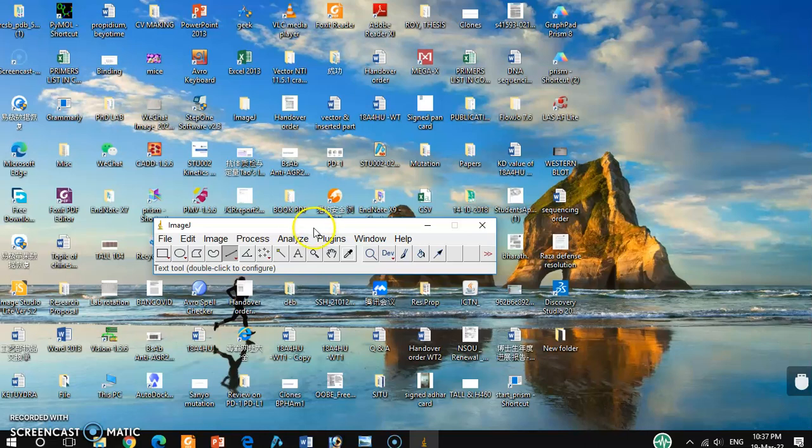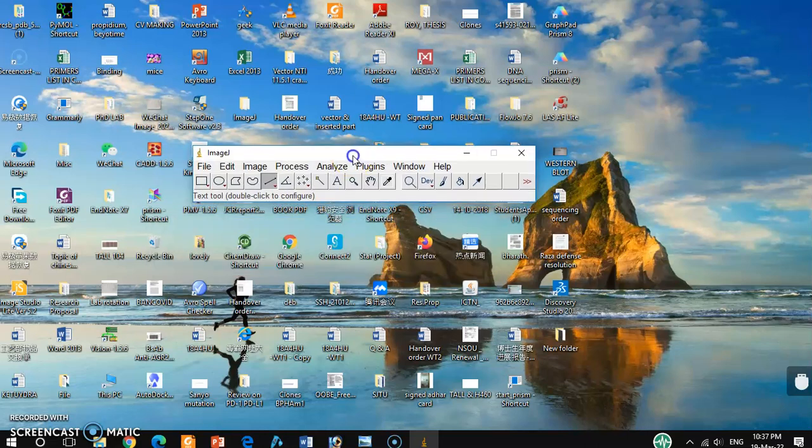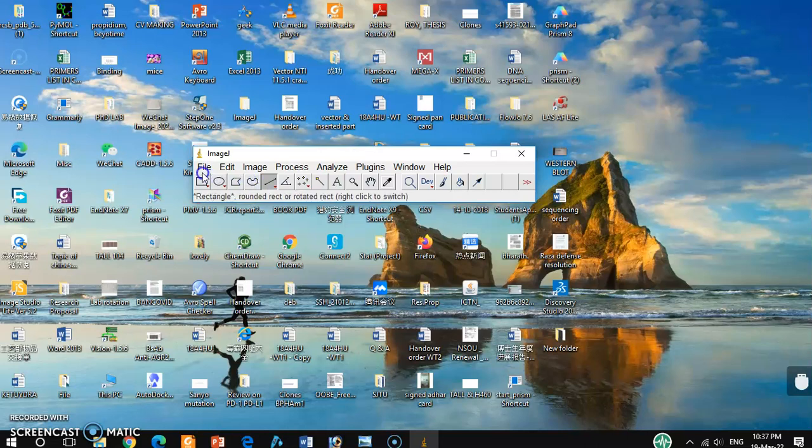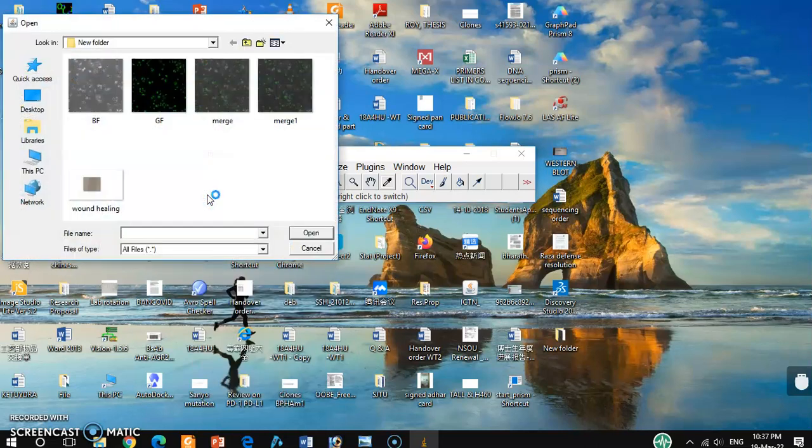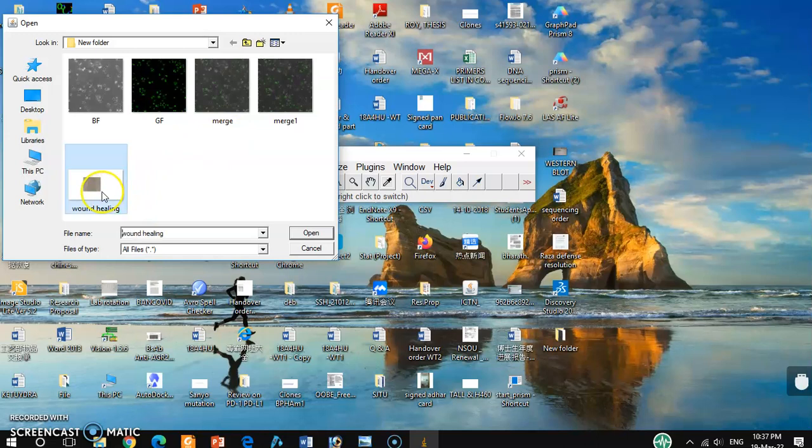And this is the image by using ImageJ. This is a very shortcut process and you can measure the distance very accurately and in a short period of time. For that, you have to open your image and then go to file and open your desired image.